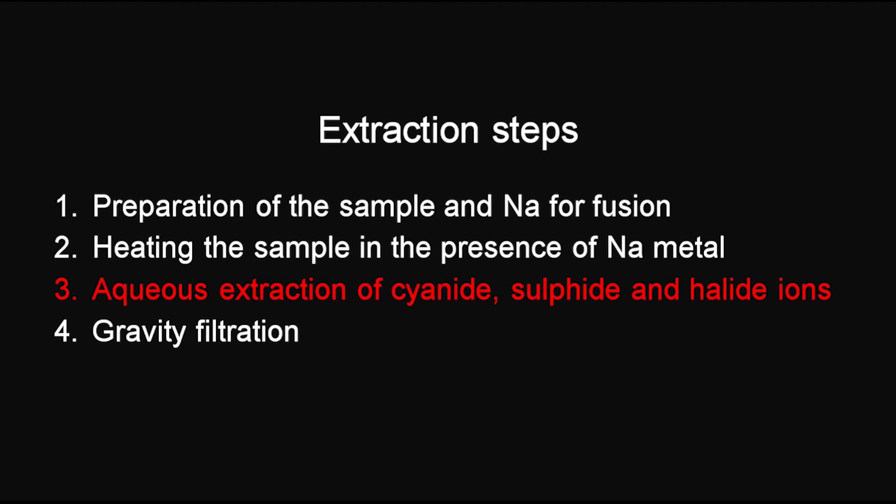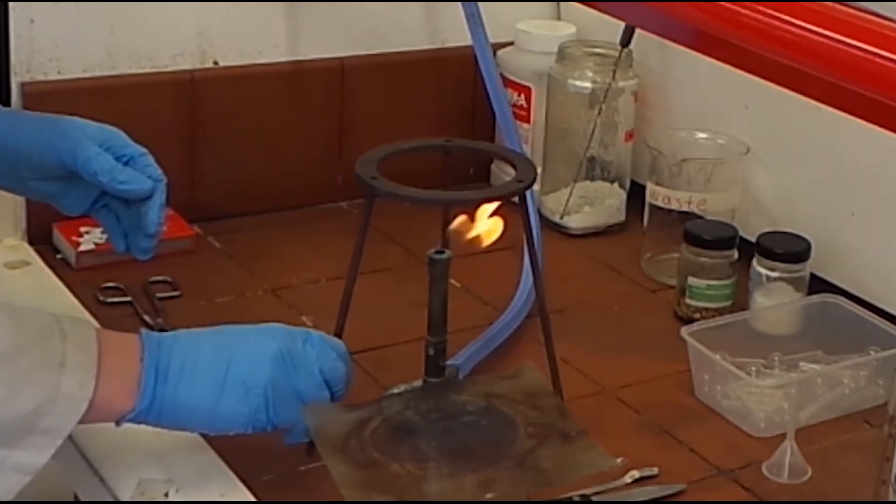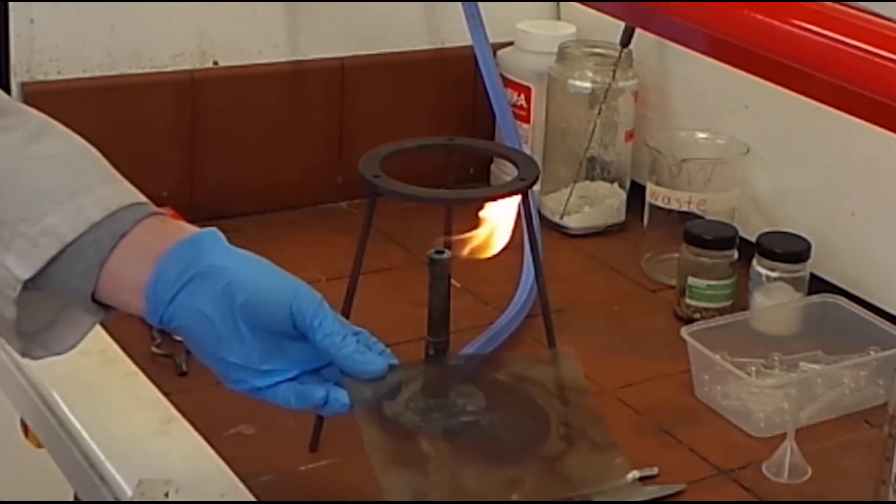Next, the contents need to be boiled. Swirl the contents in the beaker and make sure everything is combined. Then, put the contents on top of the Bunsen burner to allow them to boil.